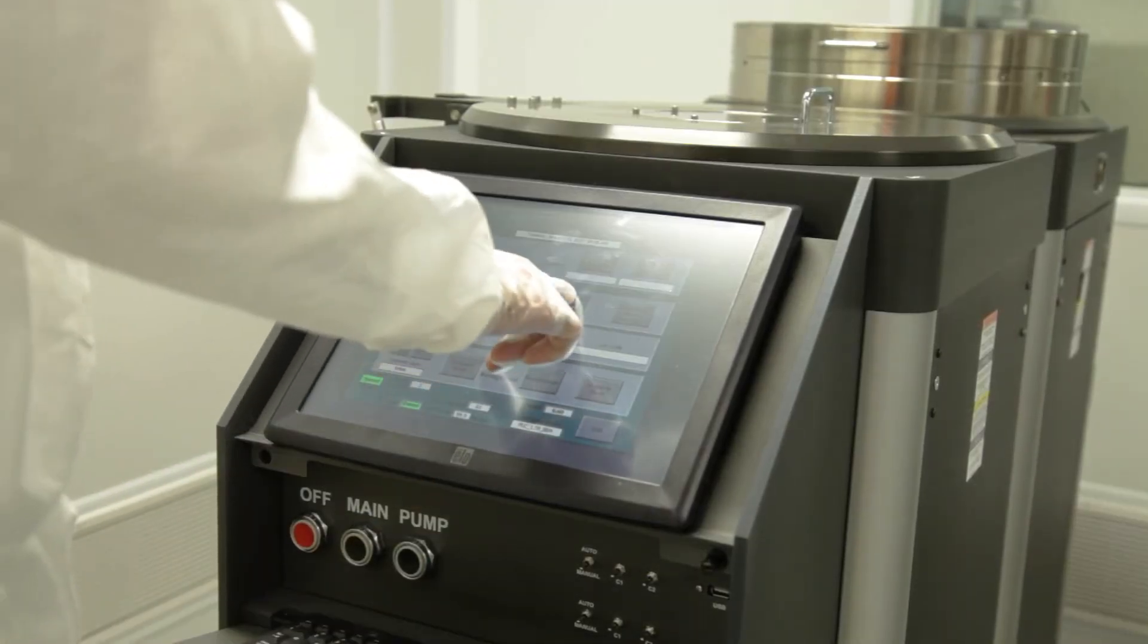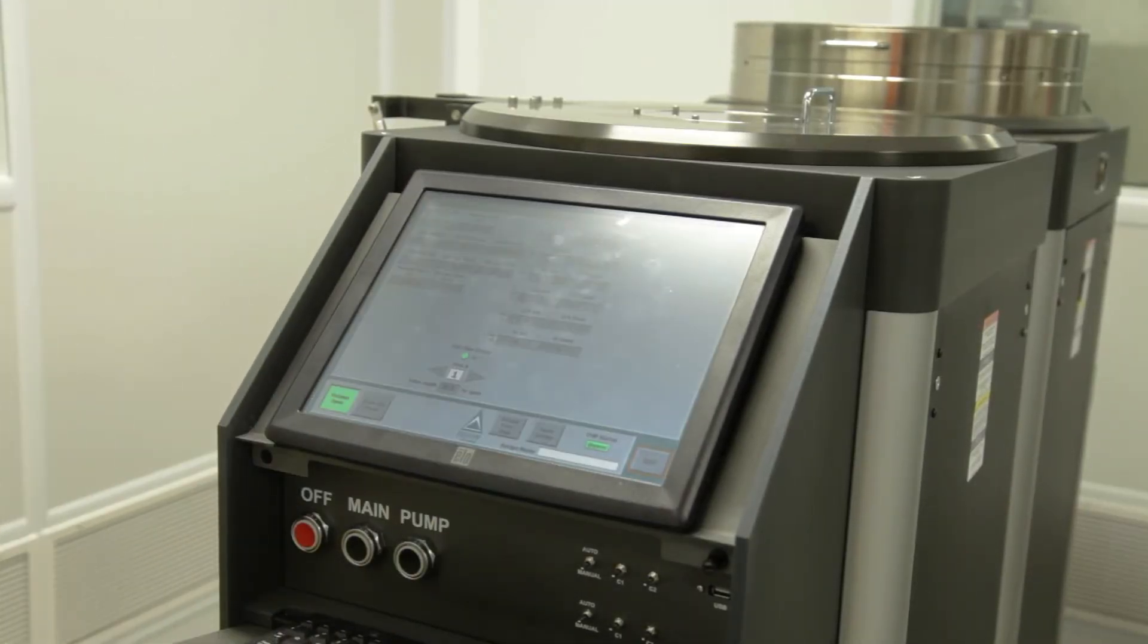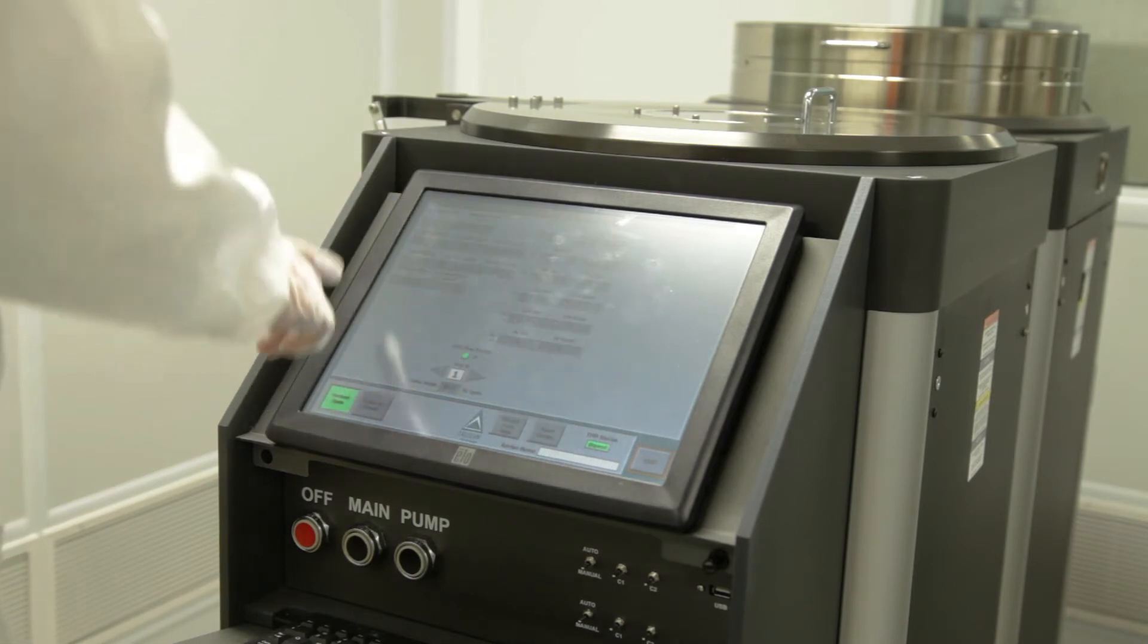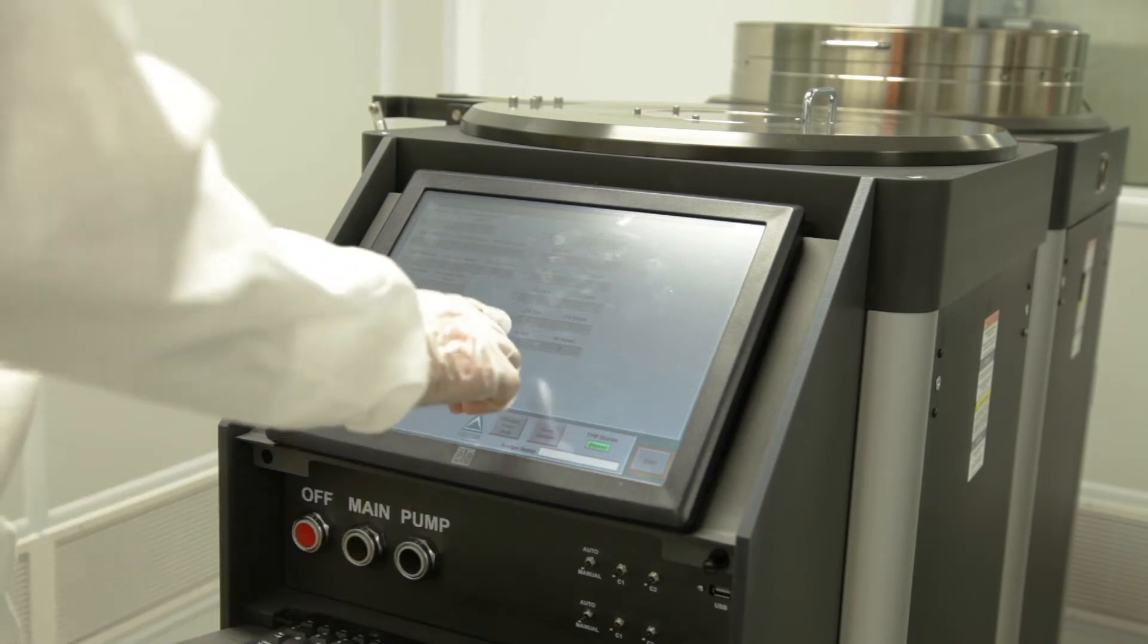This is a reactive ion etching system, which was installed only a week ago. Combined with deposition and patterning, etching away materials is a powerful microfabrication technique.